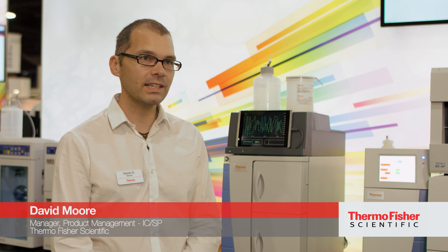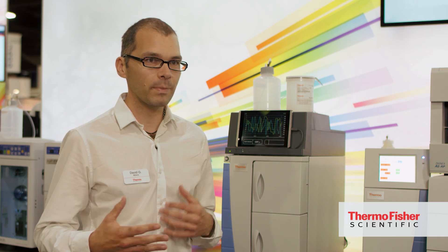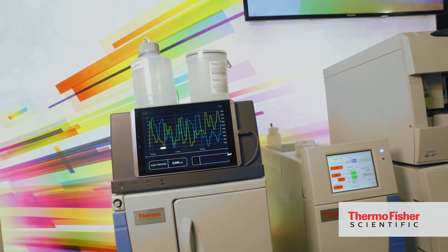What we're introducing here is the Thermo Scientific Dianyx Integrion HPIC system. This instrument is really about taking a lot of the high-end features that our customers have used to develop applications and bringing that down into the routine environment, so they can get the performance they're getting with high-end instruments.